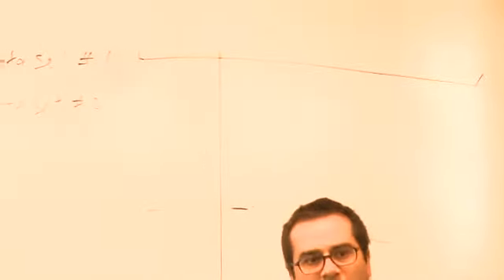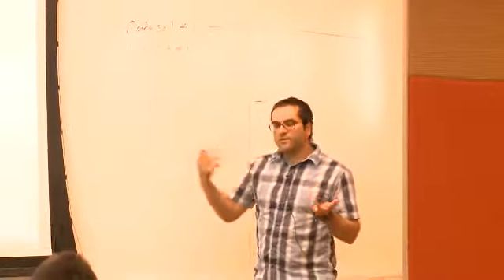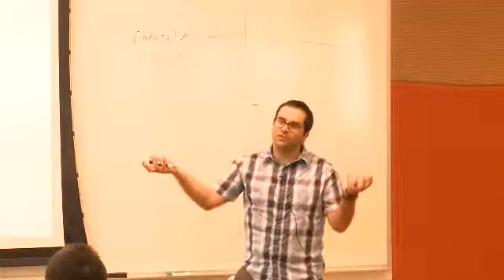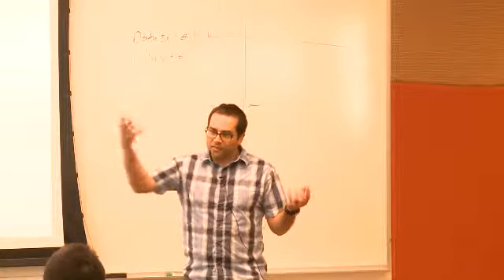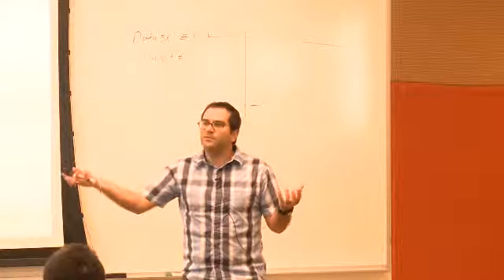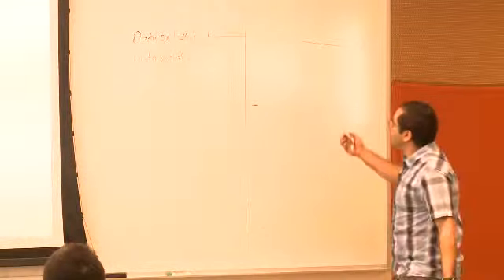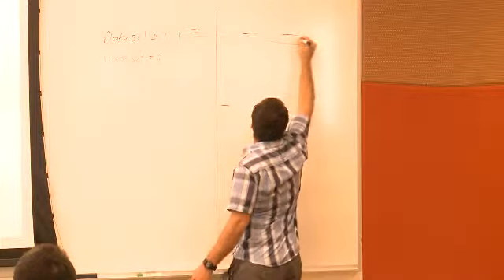So as Noam and Chuck have described, ChIP sequencing is kind of a fractionation way. We do the ChIP, we fractionate the genome to what is in association with the protein and what is not. And then we sequence the DNA pieces that were in association with the proteins. And what we get are reads falling on some areas of the genome.